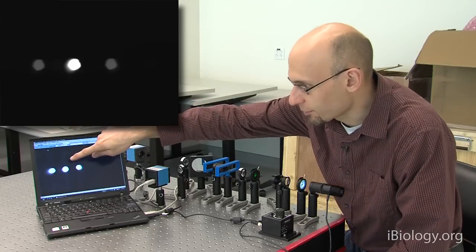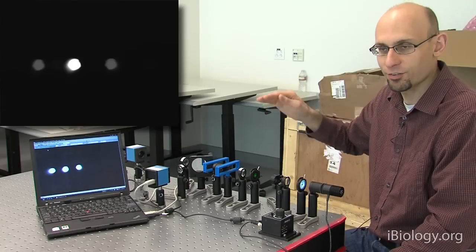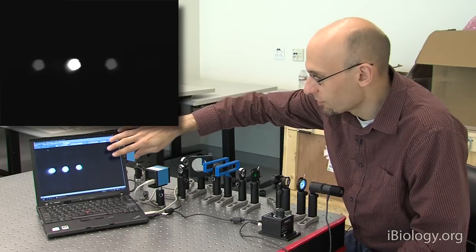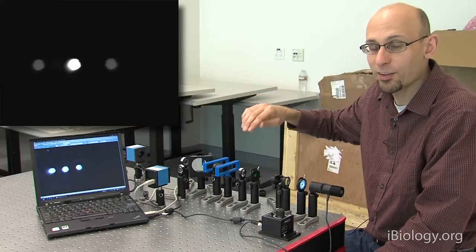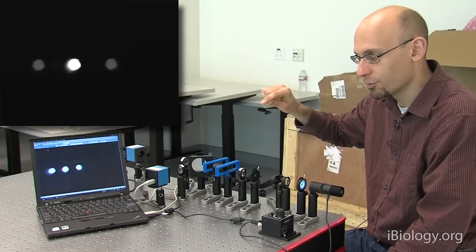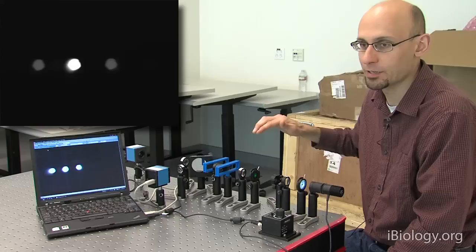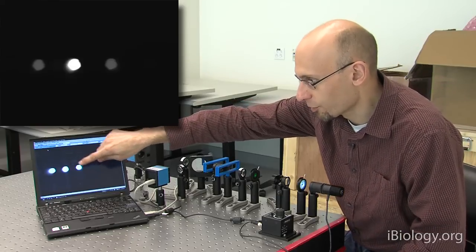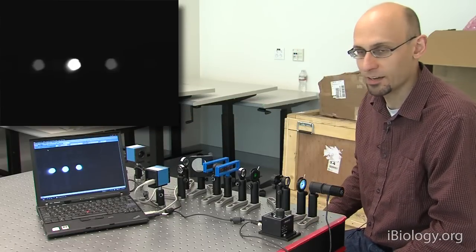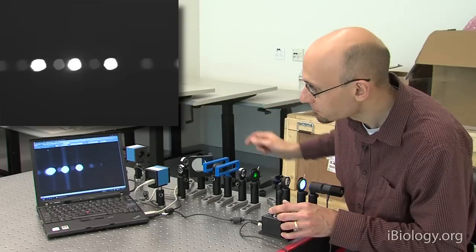So things close to the center of the back focal plane correspond to low spatial frequencies, so large-scale structures in your image, things that don't change very fast as you move across the image. Whereas positions further out in this image correspond to high spatial frequencies, so regions of the image that change very rapidly as you move position. So because this grating has very closely spaced lines, it has higher spatial frequencies, and so these first diffraction orders are located further out in the back focal plane than the grating that had coarser lines. Like the previous one, this also has higher order spots.